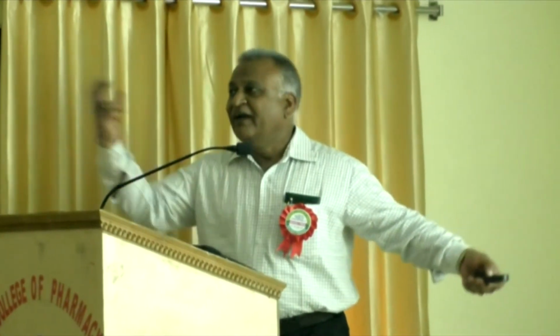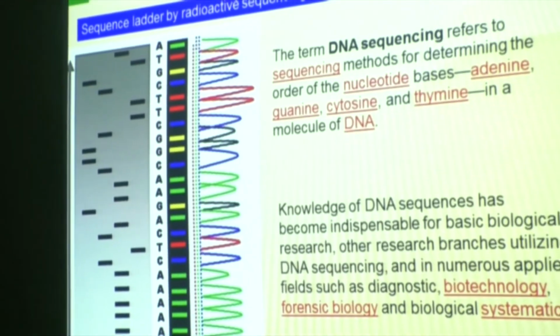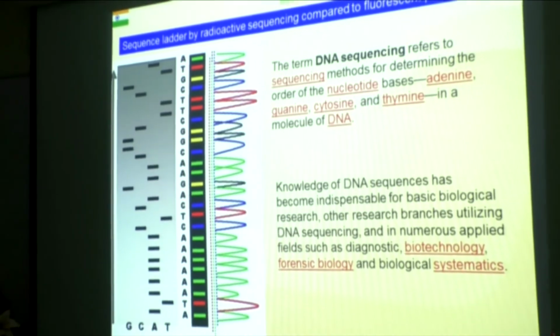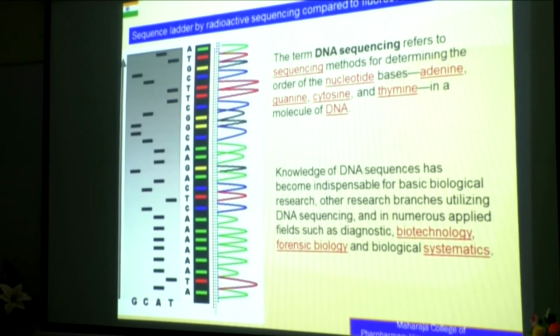Next slide. This is the DNA analyzer. You take the DNA and add specific luminescent markers which bind with each base. When you hydrolyze it, sequential hydrolysis will give you those bases, and then you push it through HPLC and you get the light. Based on that, you can determine the sequence of DNA. The entire process can be done within a day. We do have a big instrument, and small instruments are available. You put in your DNA and luminescent markers, mix it, and the instrument will do it and give you the sequence of the DNA by evening.